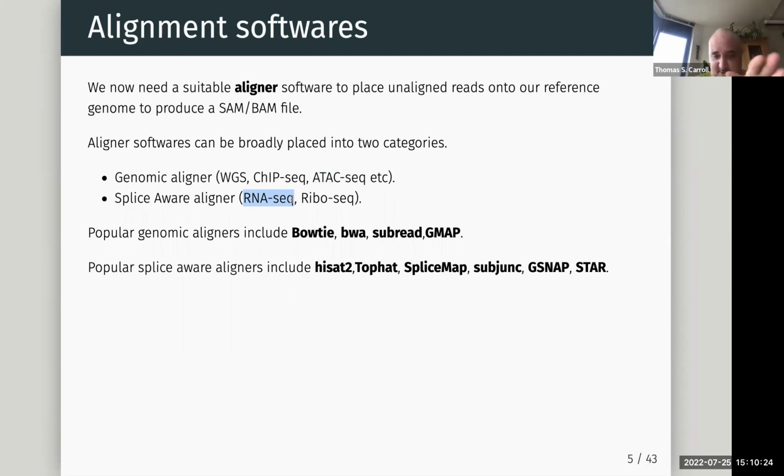You'll have splice events, which are when exons are spliced out from the full-length exon-intron genomic sequence of a gene. And once exons have been spliced out, they'll be placed together into a transcript. So sequencing that means that we're going to have reads which span from one exon to another, missing out all the intronic genomic sequence. So we need aligners which are aware of where exons may be, either from us providing a map of where exons may be, gene models like a GTF, or perhaps they know the rules of splicing. And I think there's a lariat structure, which I can't quite remember what it is. I think it's AGUT, which is often spliced. So if you see this within a gene, it's often that we'll have a splice site there.